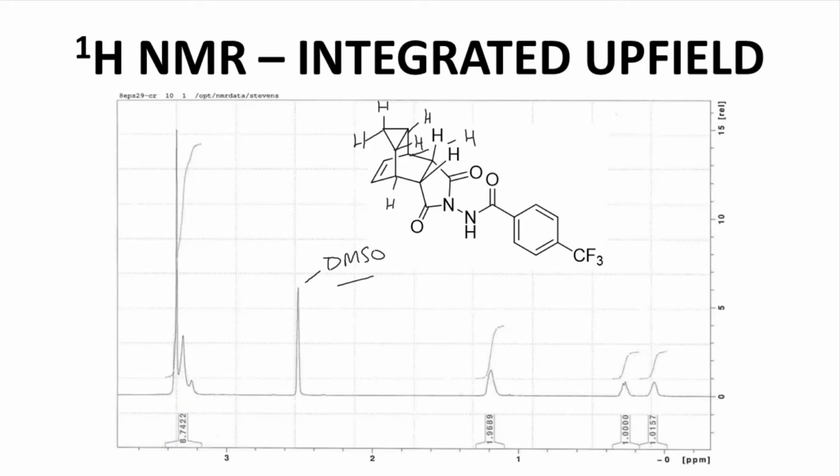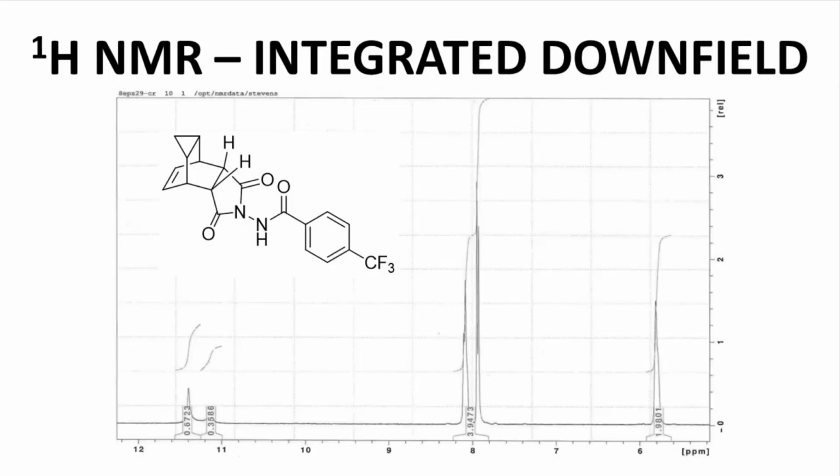The issue is the NMR solvent. DMSO generally contains water, and water shows up close to 3.5 ppm in DMSO. My best guess is that this tall peak is from water, and the remaining signals, hopefully with an integration close to 4, are from our other upfield peaks. I sort of made excuses for some of the upfield peaks. How about the downfield peaks?